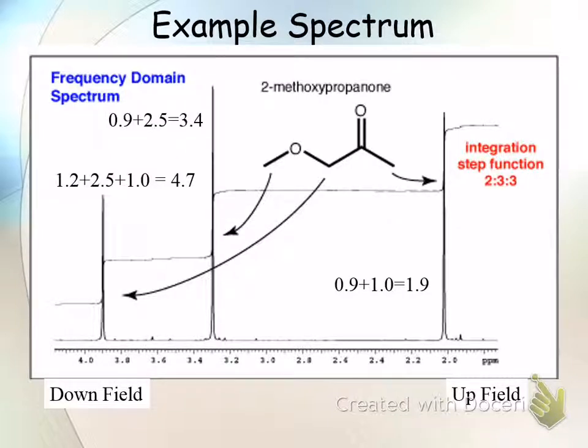trapezoids. A trapezoid rule? Got a point, get an area. I kind of lied there. It actually used what's called an integrating electrical circuit. If you guys don't know what that is, that's okay. The very first digital versions literally did trapezoid rule, and they would plot a line. This is 0, it's flat, and then this is an increase in the area. That's calculated by calculating trapezoids and scaling it to the screen dimensions, basically.